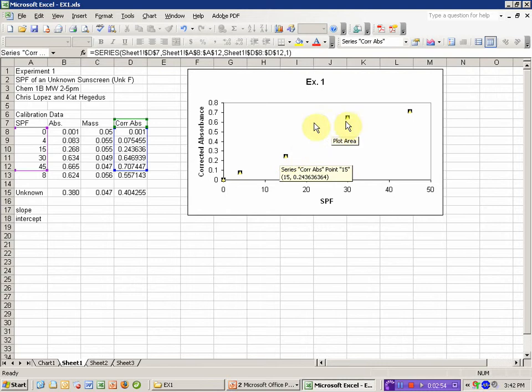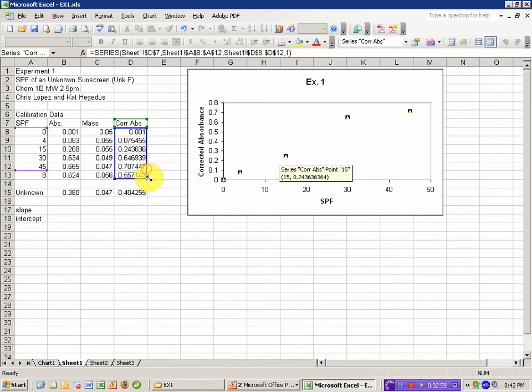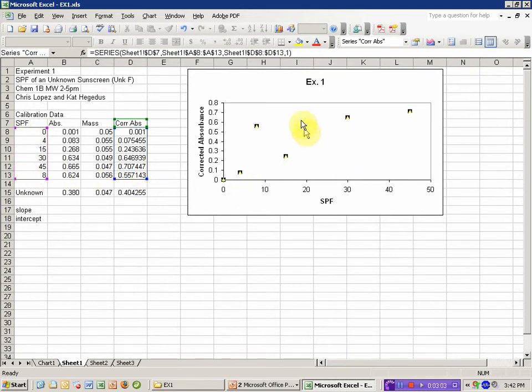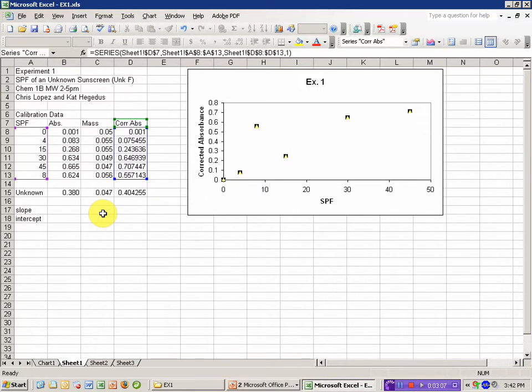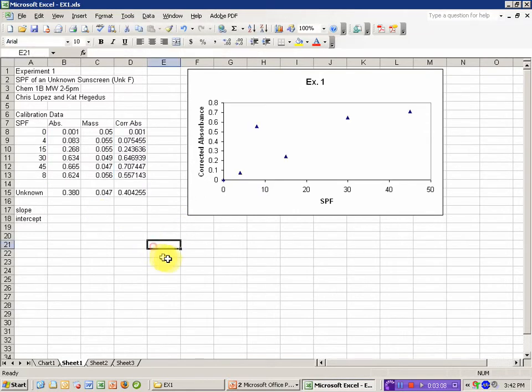I need to change the range for this data curve to include that new point. So I select it and then drag these boxes a little larger. And so now it's plotting all that information.